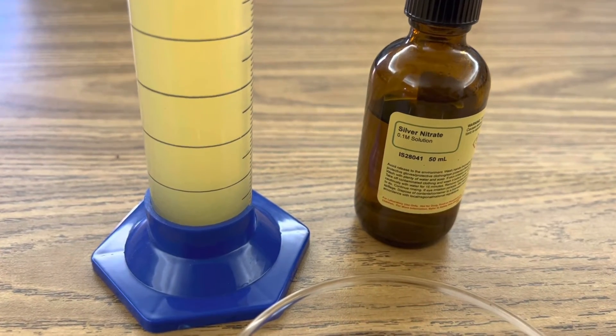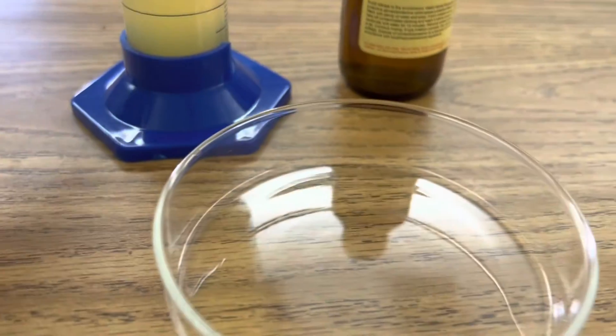Once your solution of iron sulfate is aqueous, add a little bit to your petri dish.